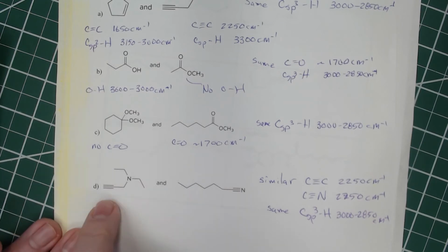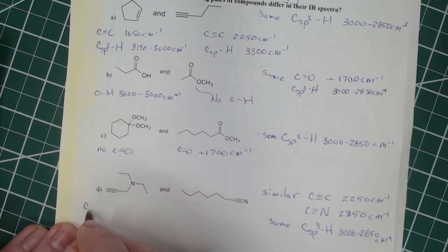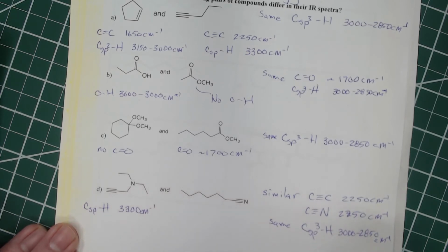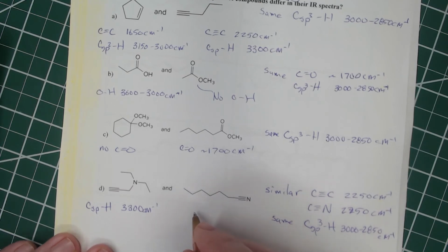Now, looking at what should be different. Well, this should have a very distinctive peak. That's carbon sp hydrogen, and it's at about 3300 reciprocal centimeters, and this one won't.